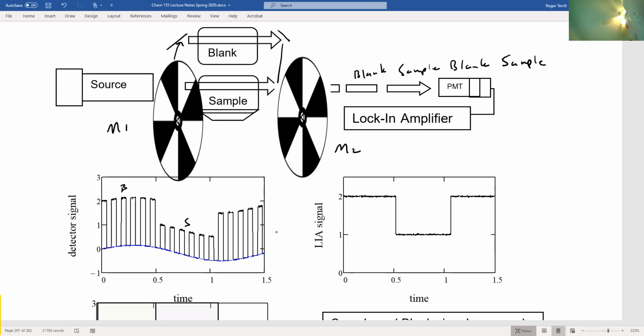What you can do is focus on the amplitude of the two signals, right? And you can cancel this slower drift. You're going to average over this period tau, but then you're going to cancel this, we'll call it tau pink. Pink noise is low frequency noise. So you can average over a short period and then get many multiples of that average, and then you can cancel the pink noise, which is this longer period noise.